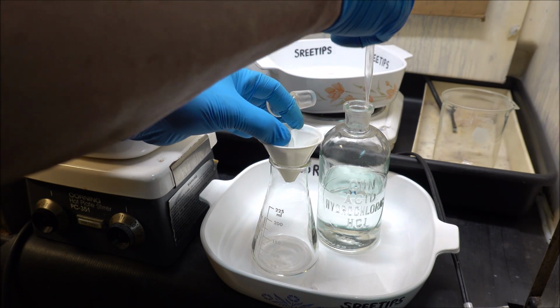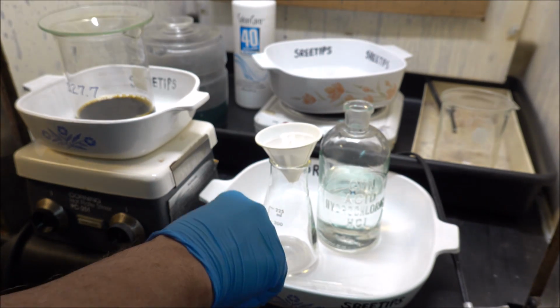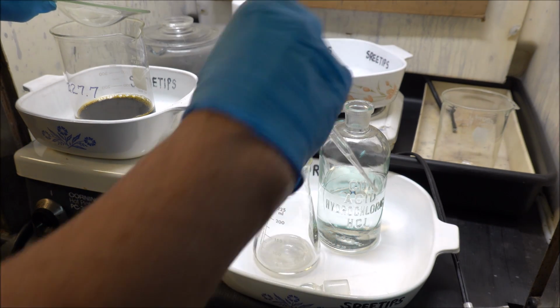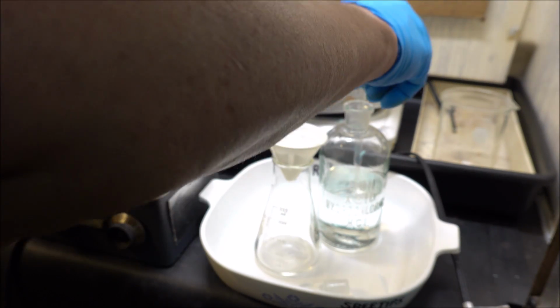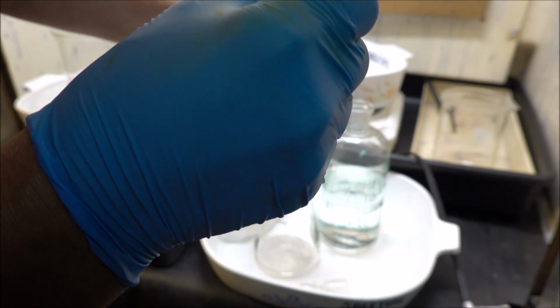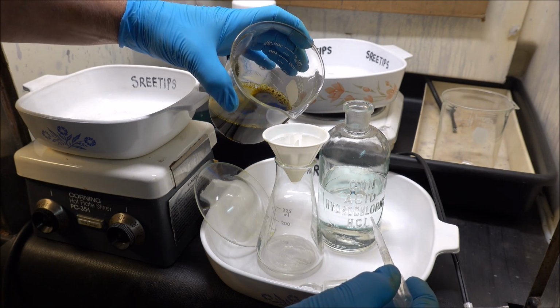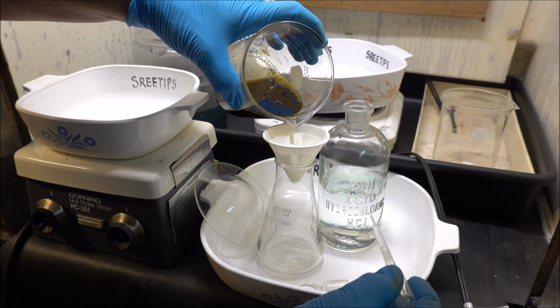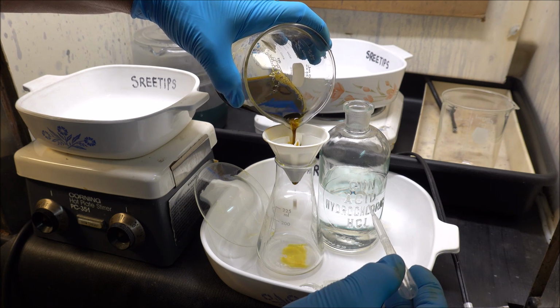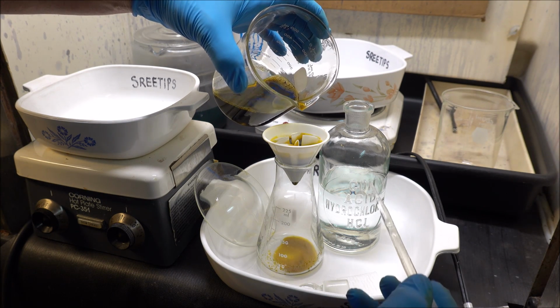moisten the filter with some hydrochloric acid, and then we're going to filter the solution, because there might be some pieces of glass in there. I'm just going to go ahead and filter this out. I've got a tiny filter paper here. And once we get the filter in here, we'll be able to see what we got left to dissolve, if anything, down in the bottom of this beaker.